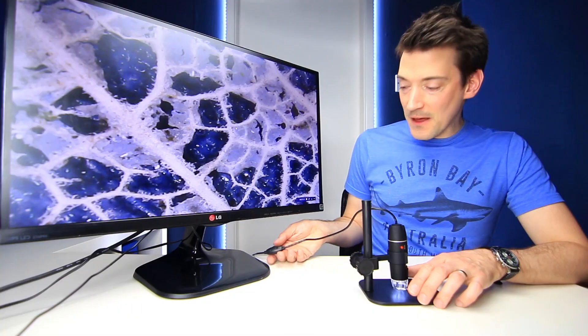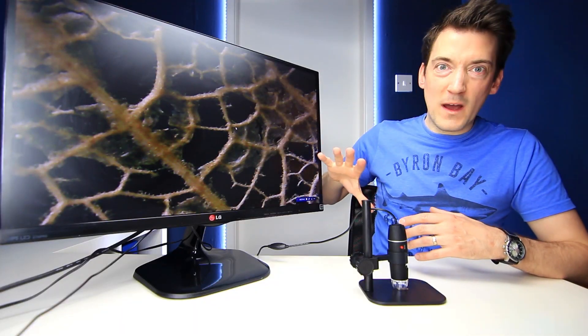That is incredible. Now this little feature here turned out to be a light dimmer — you can obviously make it bright as well. So if I turn this right down — look at that. That's the actual natural colour of the leaf, and that looks quite sinister.